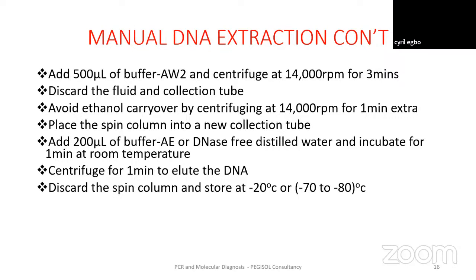So you don't need to discard that one. Once you get to elution, the content in that collection tube becomes your DNA template. So you save it. If you want to use it immediately, you use it. But if you don't want to use it right away, maybe you want to use it in 2 days, 3 days, a week's time, you can store at -20 degrees centigrade. But for a longer time, for years and all that, you can store at -80 degrees.